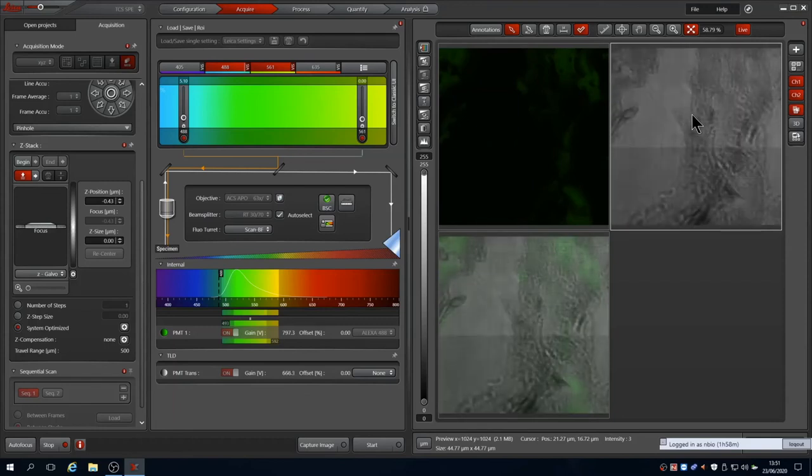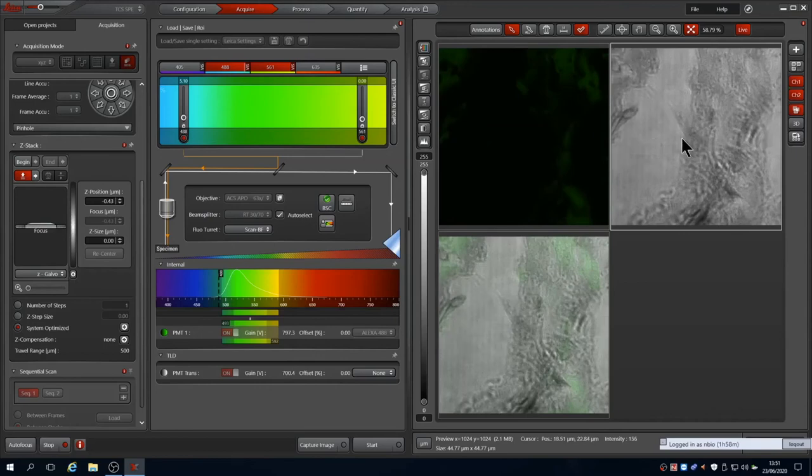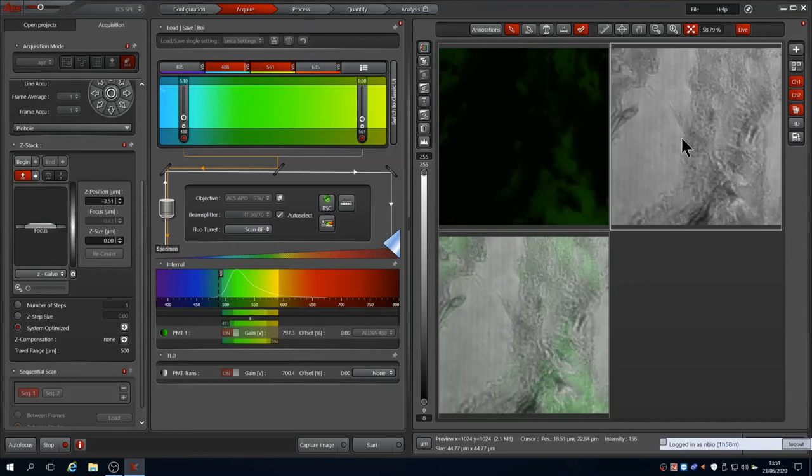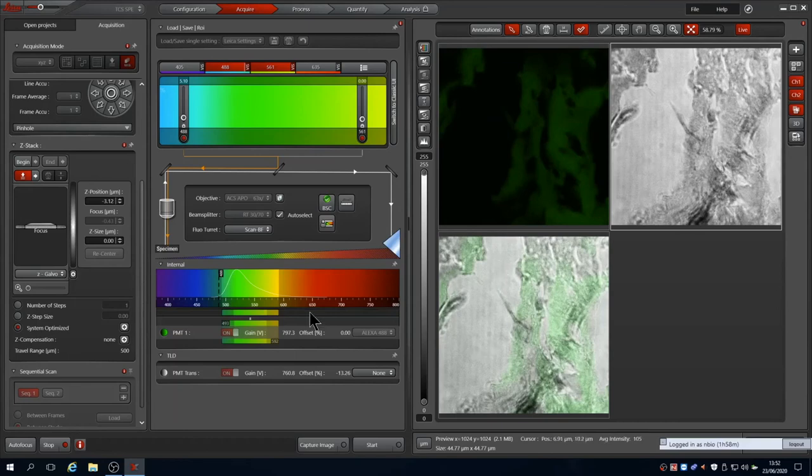Once happy, use Start to scan your image. You will see that TLD is only active in the first sequence.